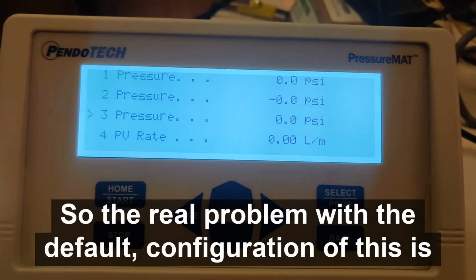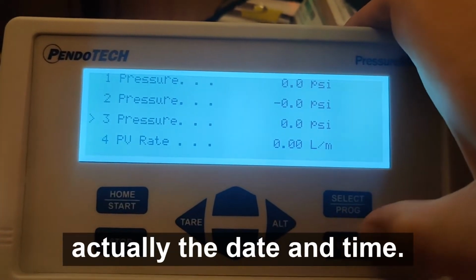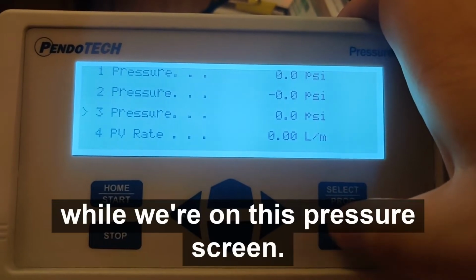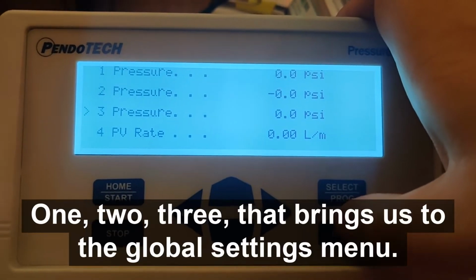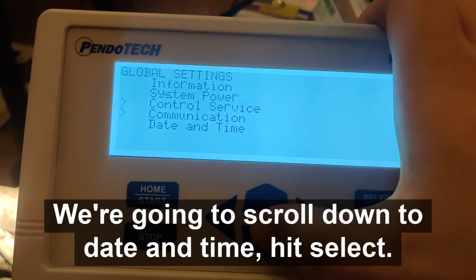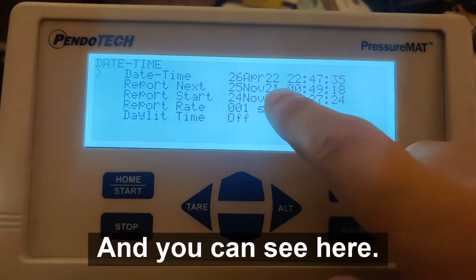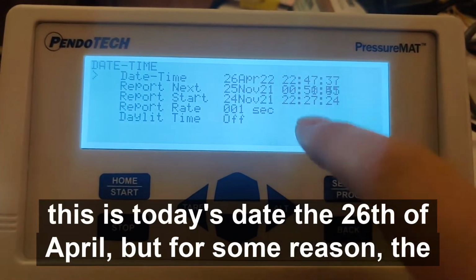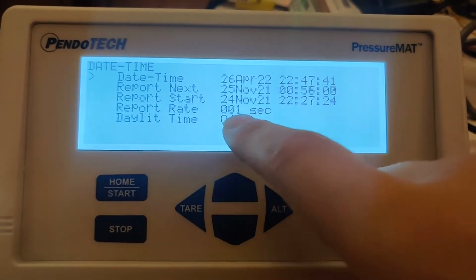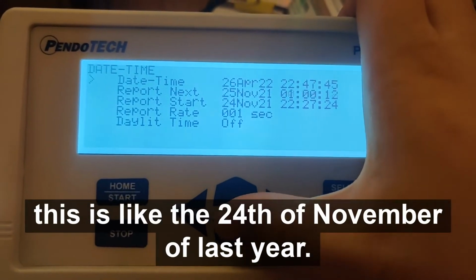So the real problem with the default configuration of this is actually the date and time. So to fix that, we're going to hit back 3 times in a row while we're on this pressure screen. 1, 2, 3. That brings us to the global settings menu. We're going to scroll down to date and time, hit select, and you can see here, this is today's date, the 26th of April. But for some reason the report start time gets defaulted to some random value. This is like the 24th of November of last year.